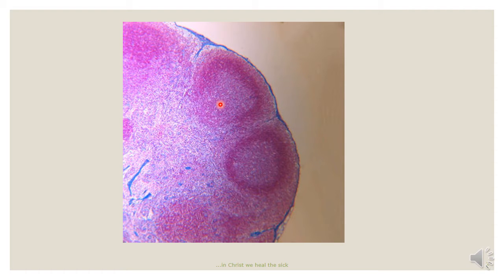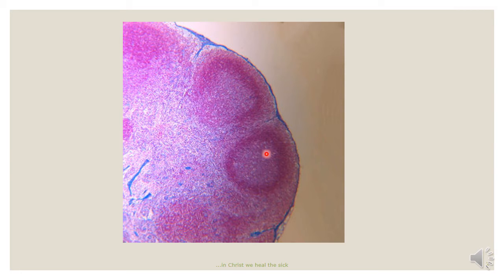The follicles are actually aggregates of B cells. These B cells can be in the resting state, as seen in the primary follicle, or in the active state, as seen in the secondary follicle. The secondary follicle contains a pale center called the germinal center, that is surrounded by a darker zone called the mantle zone.